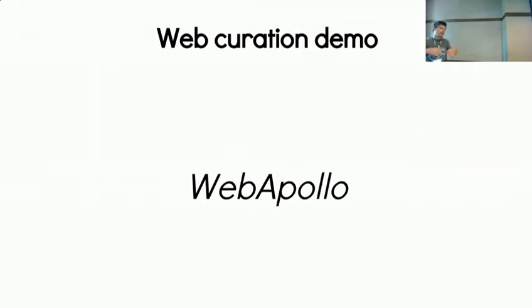And that'll come back, which is, of course, the point of running in Galaxy, is you can bring those workflows back in. So it's going to create a GFF3 and FASTA downstream. And if someone creates a tool for re-merging those with existing GFF3.